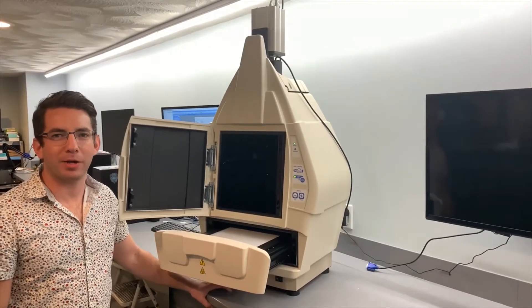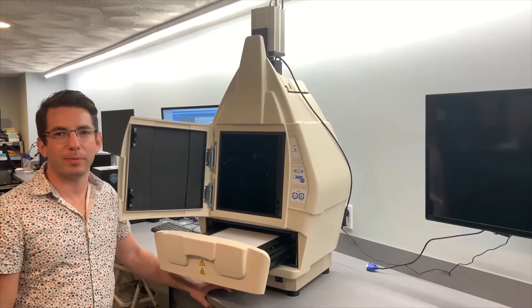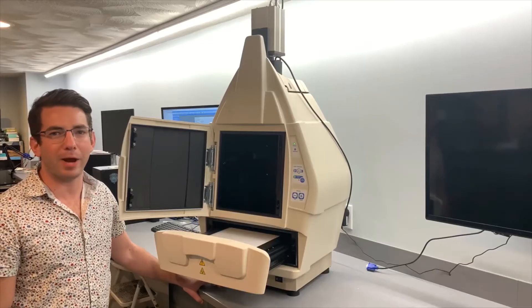Hi, this is Brian here with Boston Microscopes. As many of you know, we have a wide selection of refurbished and new microscopes and cameras, but did you know that we also sell refurbished imagers? This imager is the Bio-Rad Chemidoc MP.